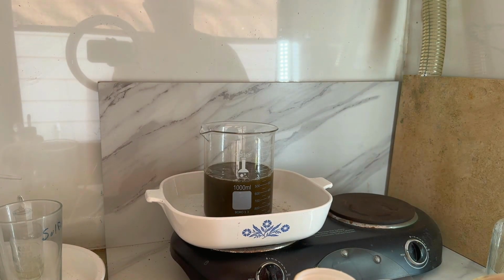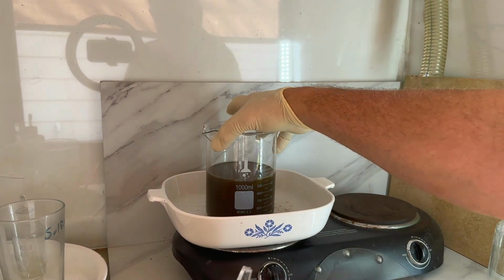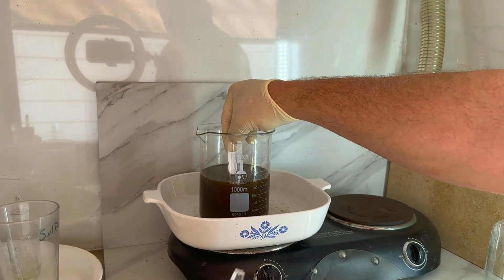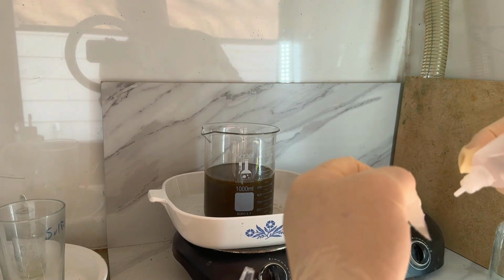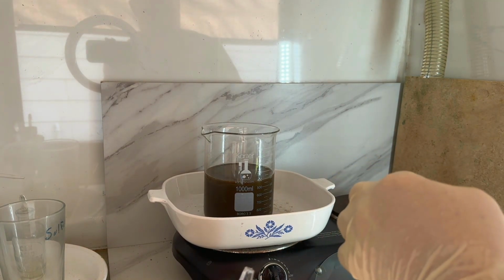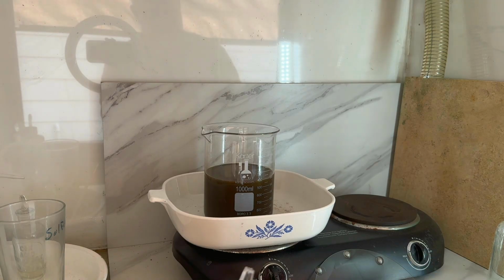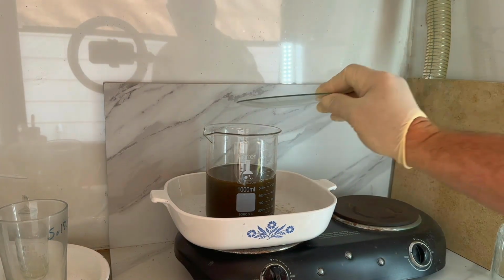Add a little bit more. That's probably enough. Go ahead and stir that around. Do a quick stannous test. It's a stannous chloride. It's an indicator whether gold is still in solution. Bring it out, take a look-see. And we have no color change, so it is fair to say we have no gold left in solution. So we're going to go ahead and cover this and let it settle, and then we'll proceed to washing, drying, and cleaning that gold up.